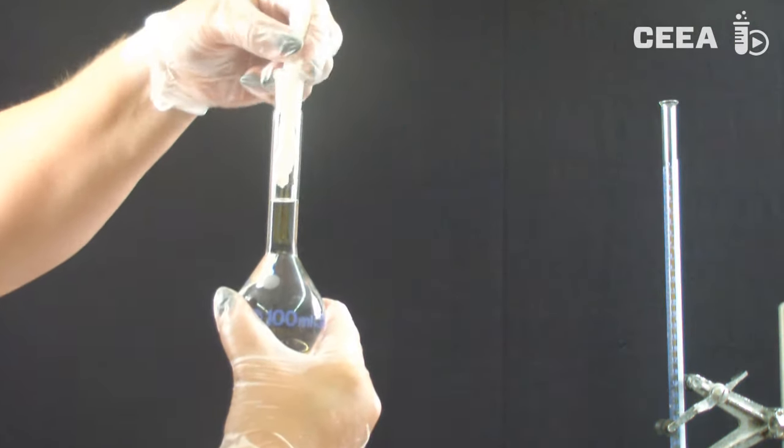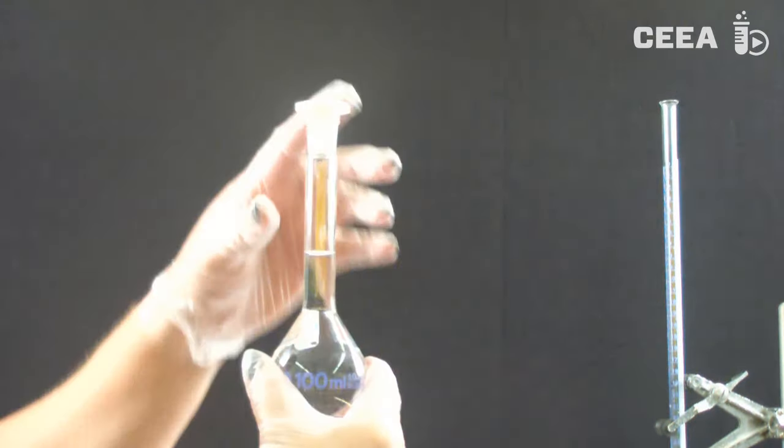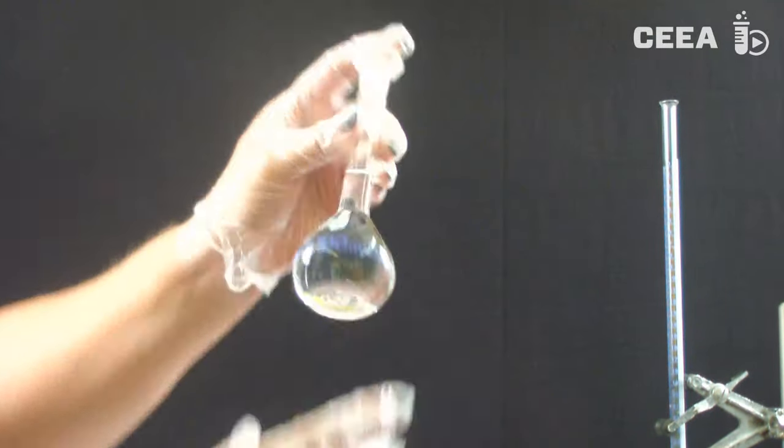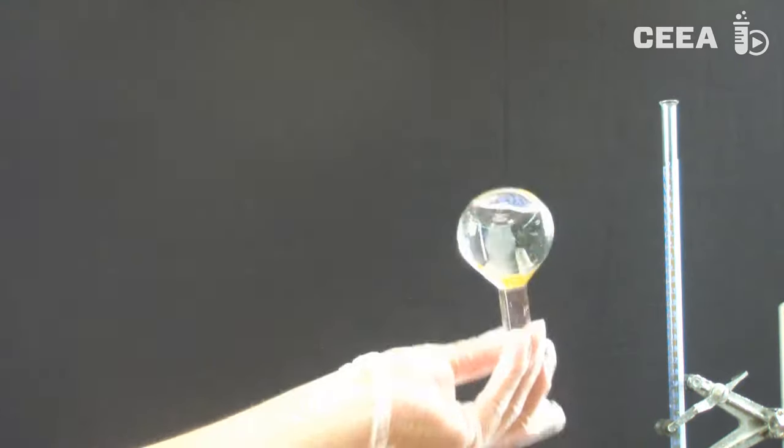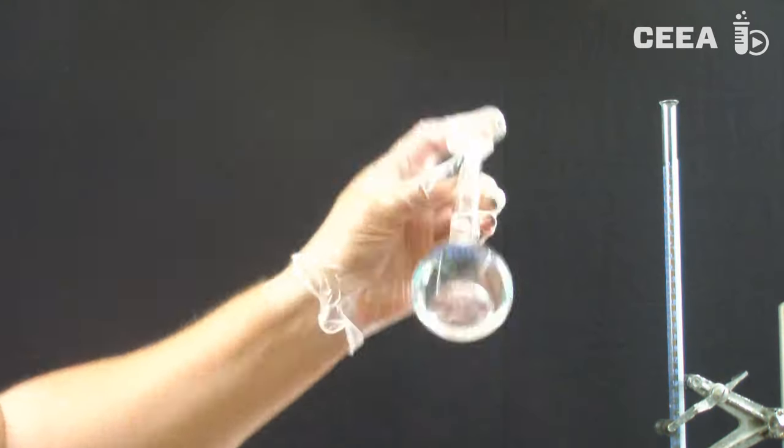Dry the inside of the top of the volumetric flask with filter paper, and next, swirl gently at least 10 times to homogenize the sample.